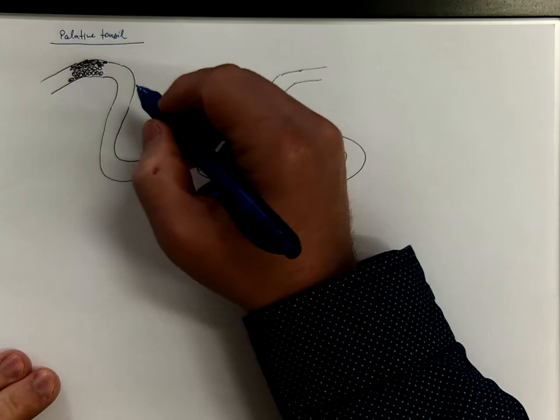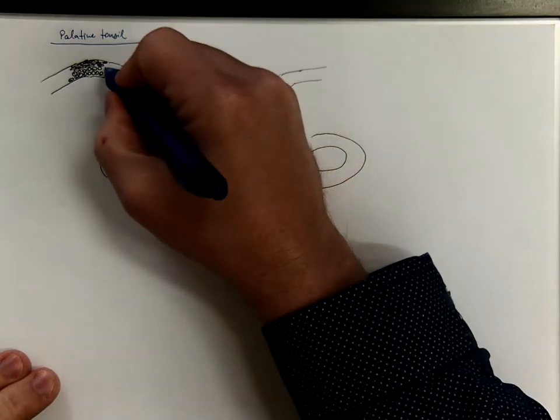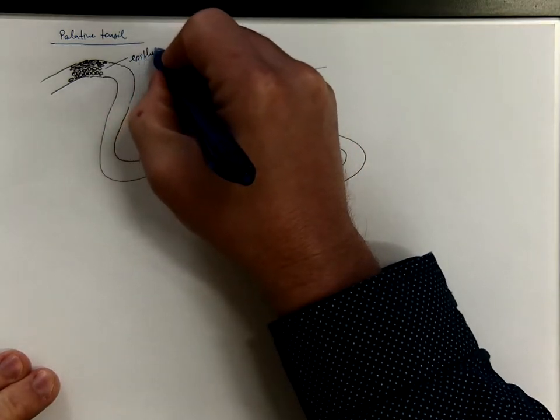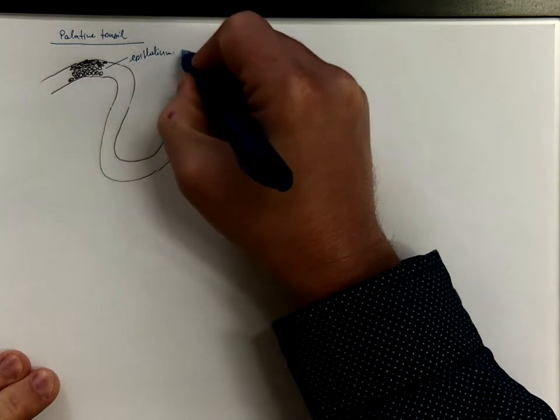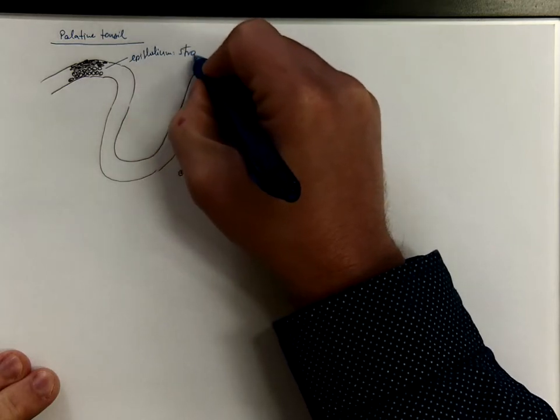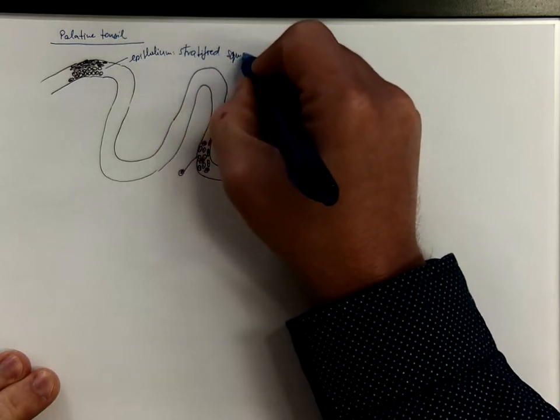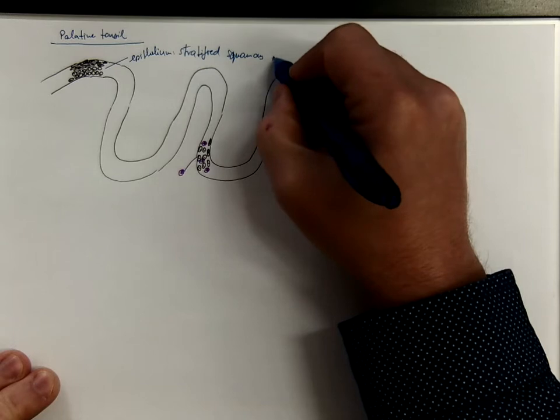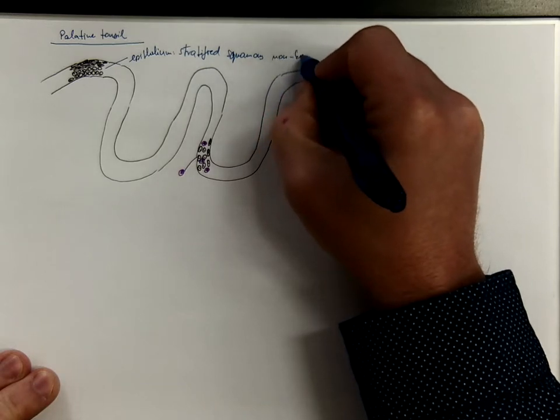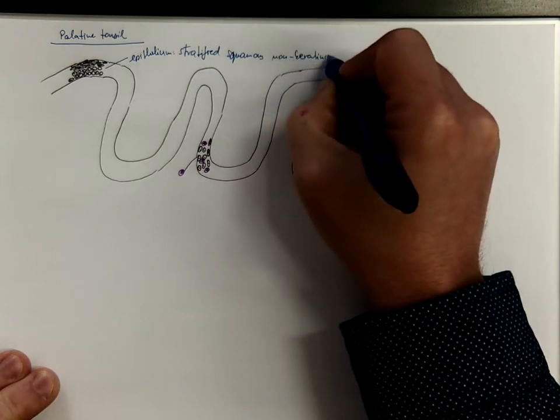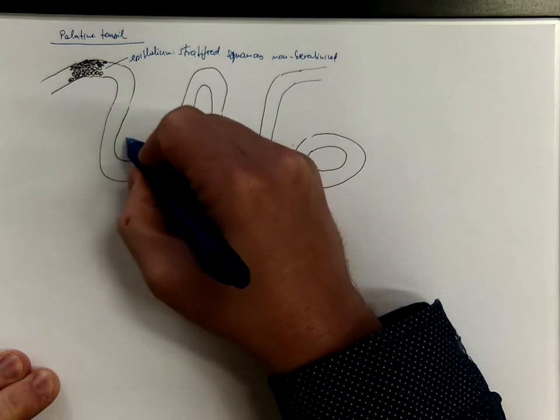So if this is the epithelium, it's stratified squamous non-keratinized. We have these crypts.